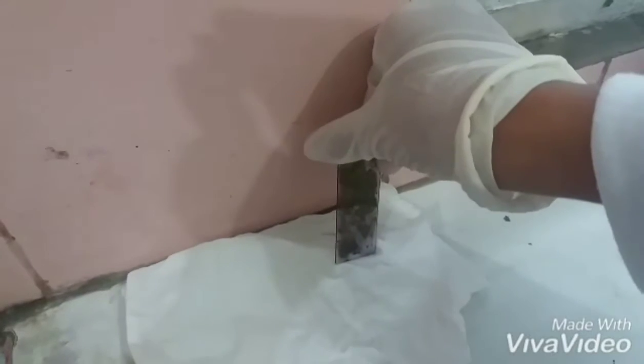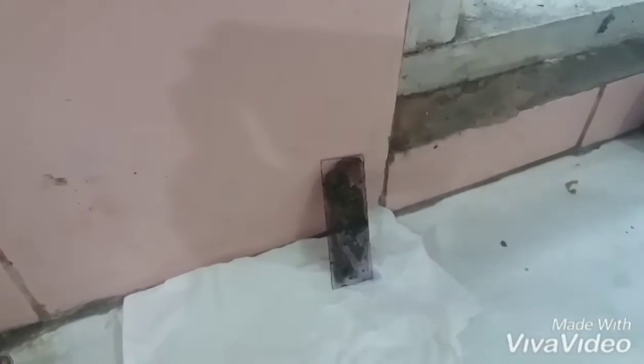Then we rinse with water again. We drain it like this until dry. Enough, so this is the Ziehl-Neelsen method.